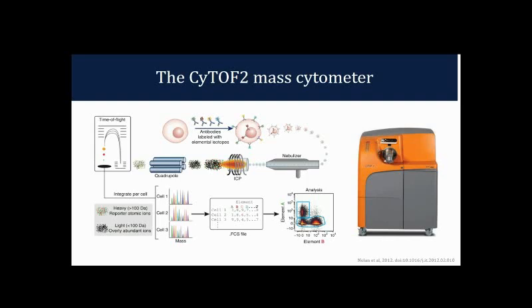of the tools that we use are the same tools that would be used for flow data. And that's, I think, something that makes getting into this kind of data analysis really helpful, is that it's not a completely new way of looking at data. We're very familiar with the format. It's just the fact that your little X and Y axes now have 40 parameters instead of 10.